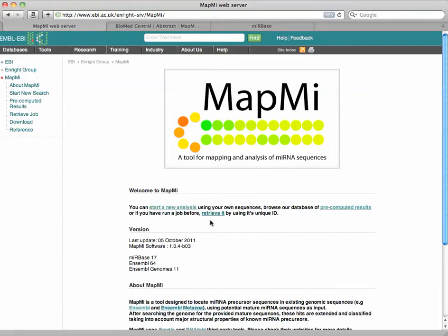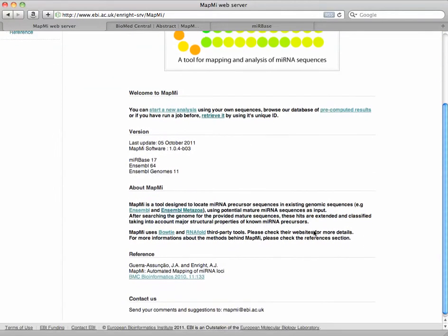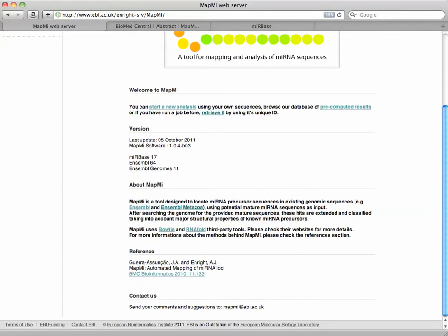You can start an analysis using your own sequences or browse the database of pre-computed results. What we're going to do is just do a quick new analysis. Let's scroll down here a little bit to find out more.